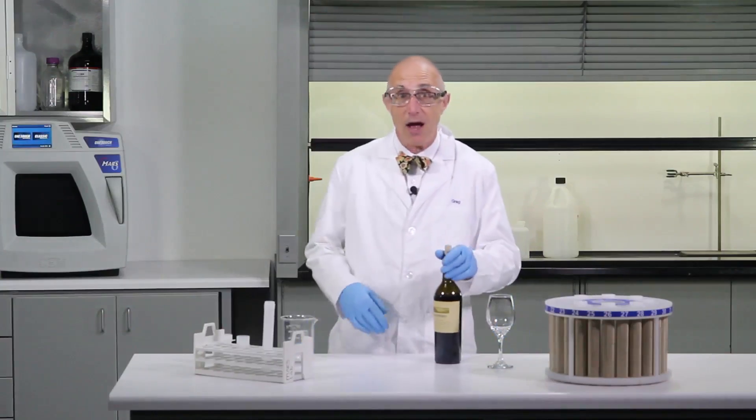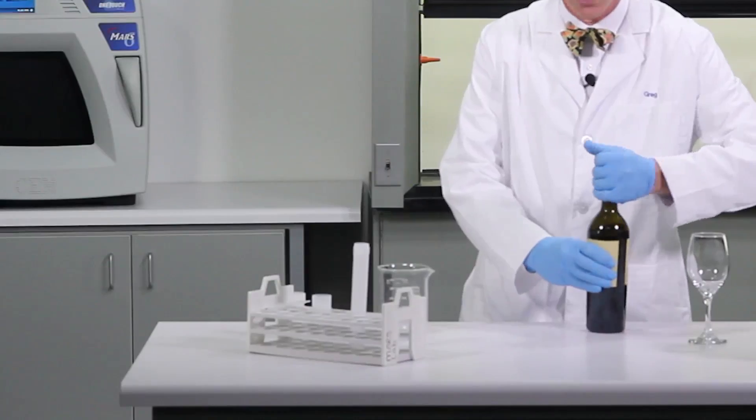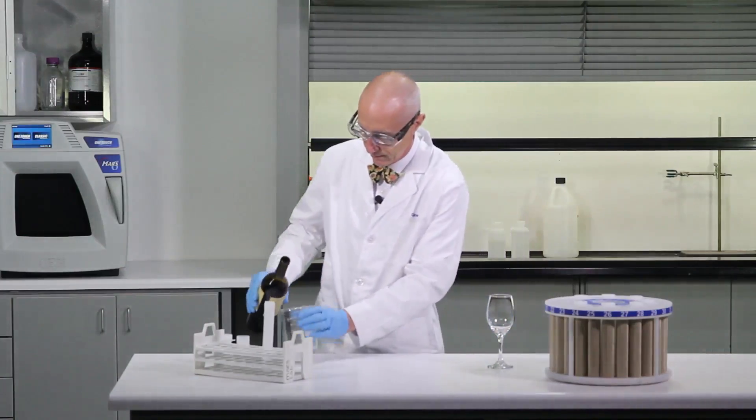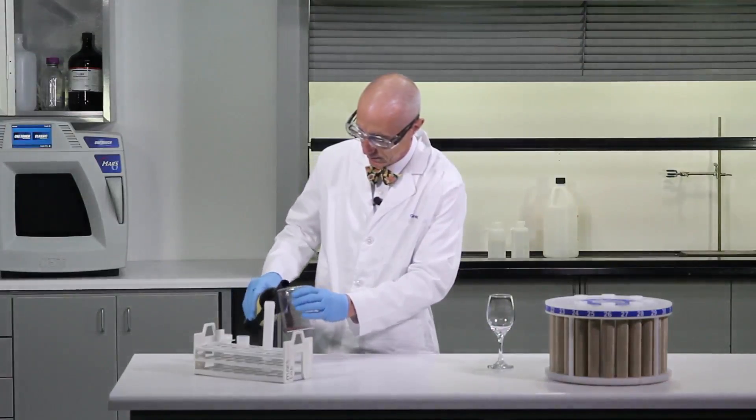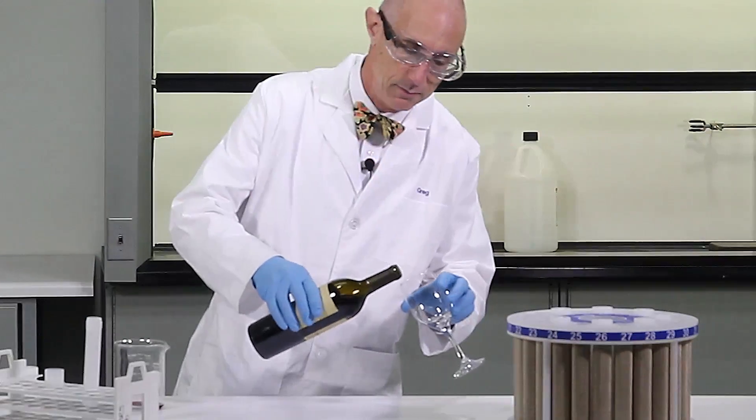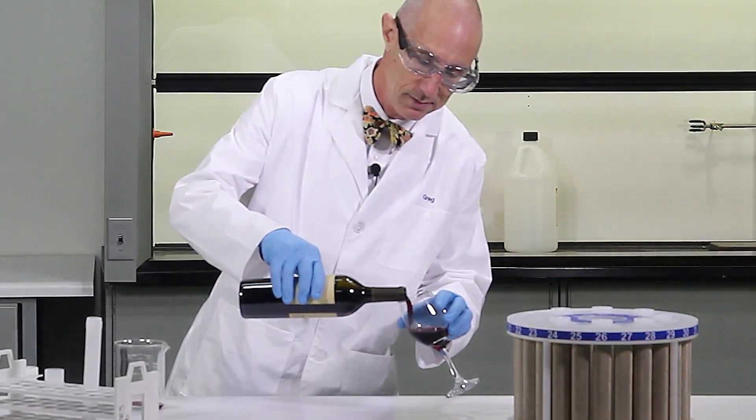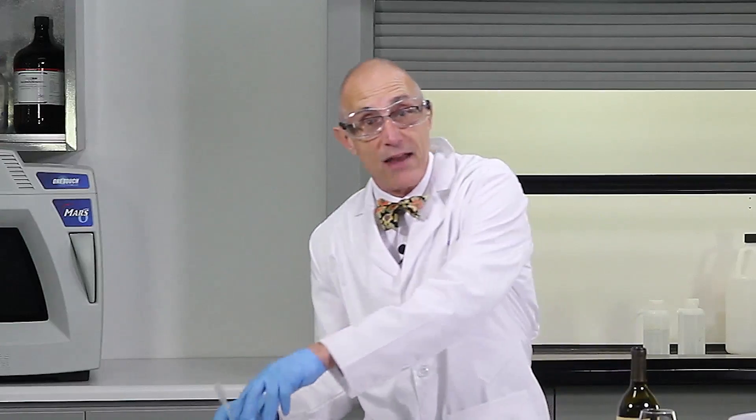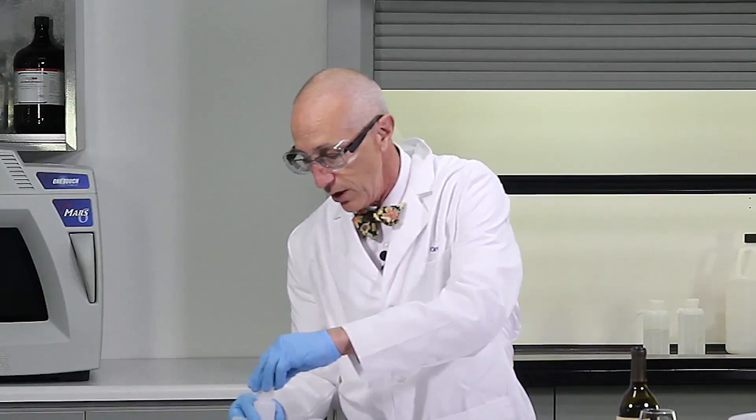As we acid digest our wine, we'll need to take into consideration that wine is high in sugar content, so we'll want to do a significant pre-digestion step. We'll add about 5 mLs into this beaker. Next we're going to add the nitric acid into our beaker for the pre-digestion step.